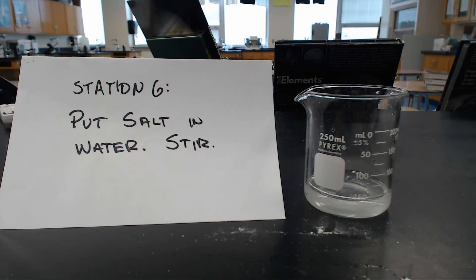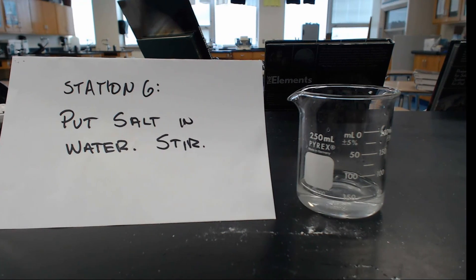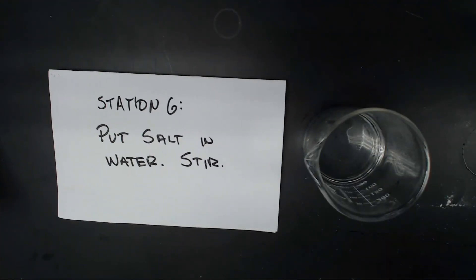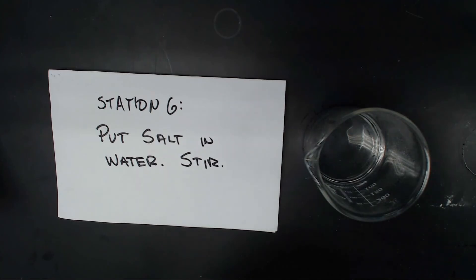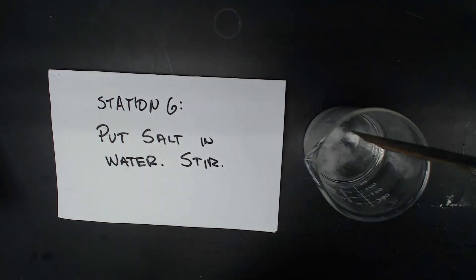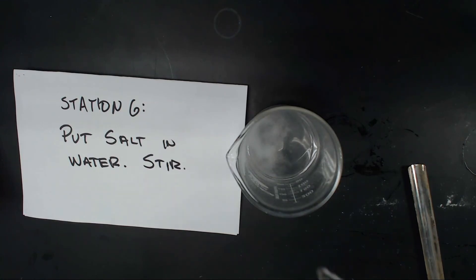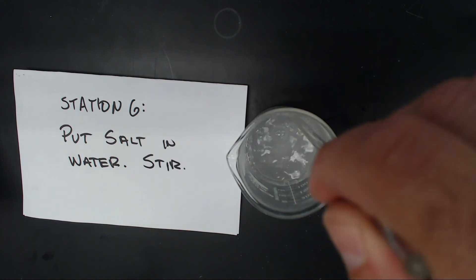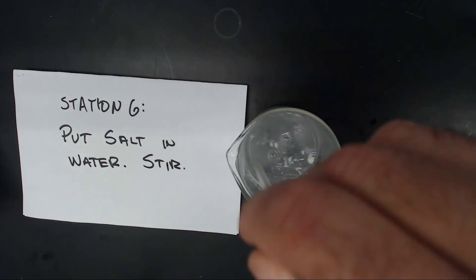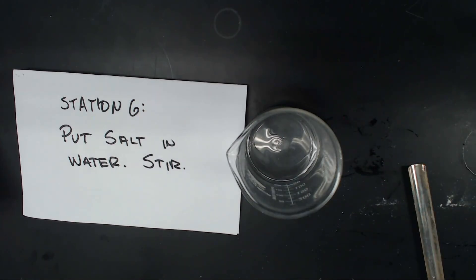I'll do this from up top so you can get a better sense of what you see. I have a beaker with water in it. I'm going to take my sodium chloride — you can see sodium chloride — and add a scoop of that to this water. A little more, just to get the idea. I'm going to take my glass stir rod and stir it. After you stir it, you can tell that you can't see the salt anymore.